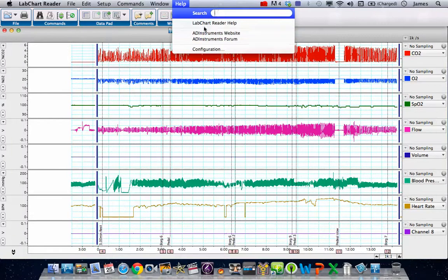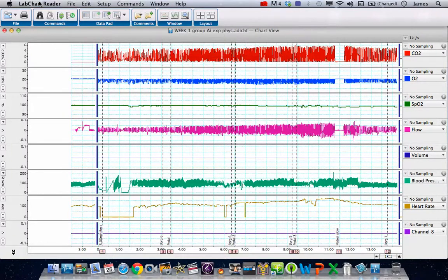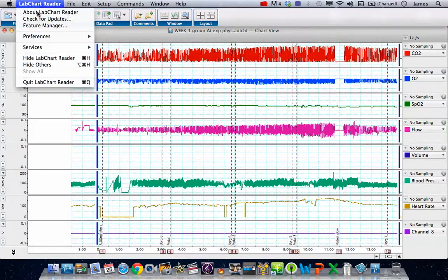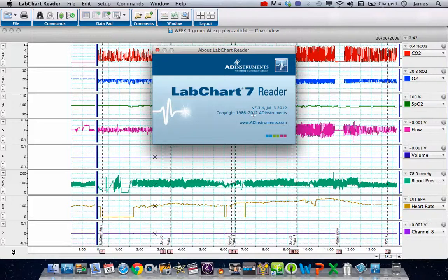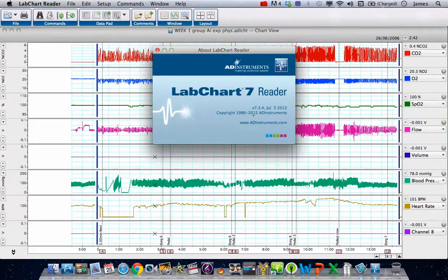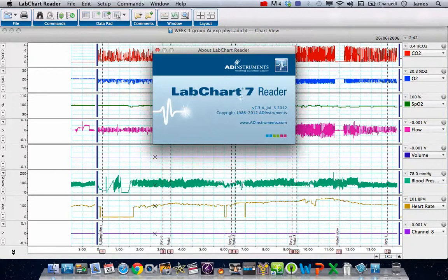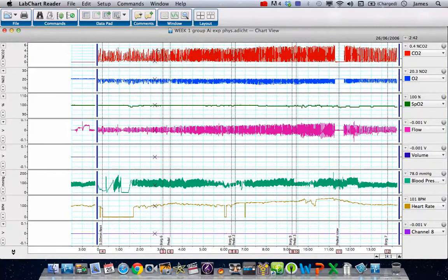If I go to the help here and select About LabChart Reader, you can see it's version 7.3.4, which was the July 2012 release. This is the latest version of LabChart Reader 7 that I got off the AD Instruments website this morning.